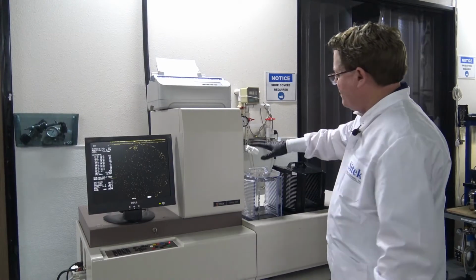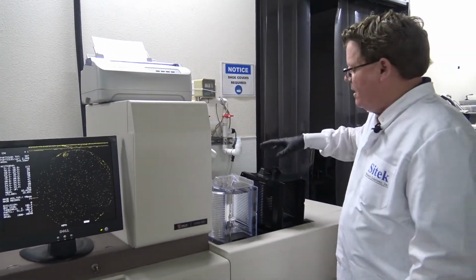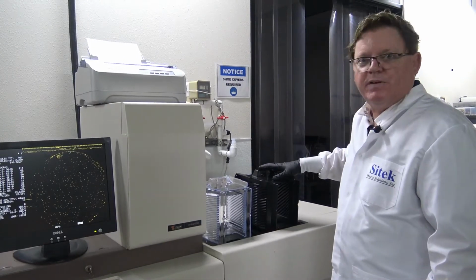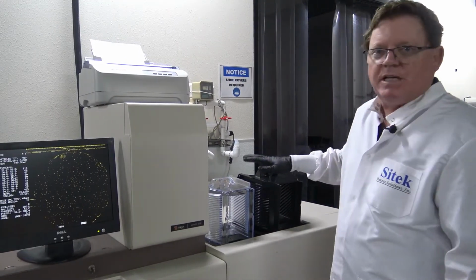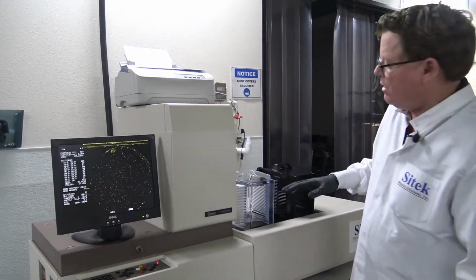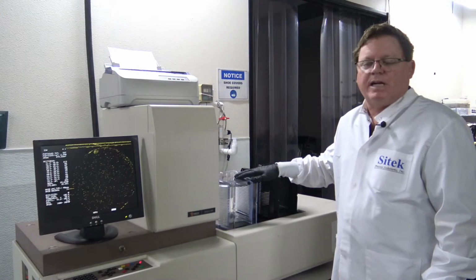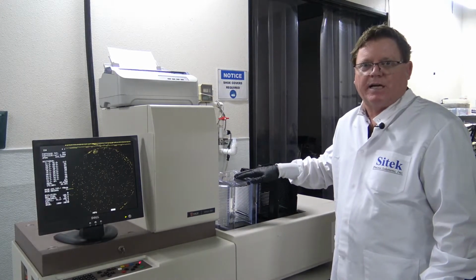So what I'll do is, the tool has the capability of running in single or multi-mode. Multi-mode means it takes the wafer out of the send cassette, and as long as it passes the particle check, it puts it in the receiving cassette next to it. I'm going to do a test of multi-mode. I will show the screen. Then I'll put it in single mode, and single mode will take it out of the send cassette and put it back into the same send cassette.